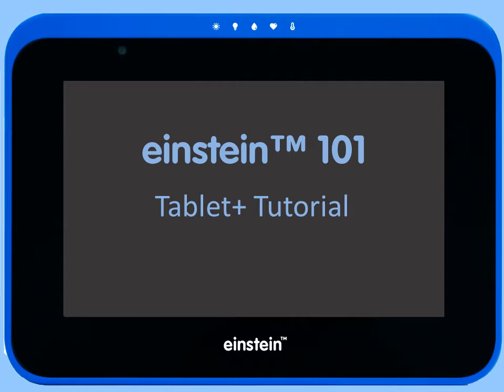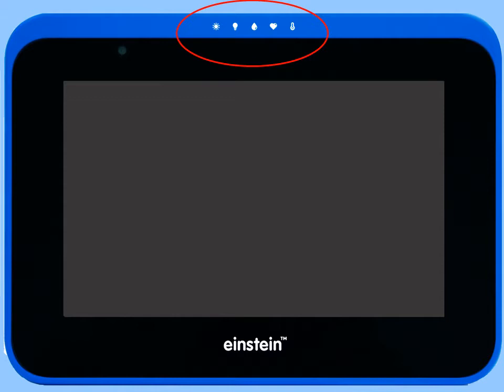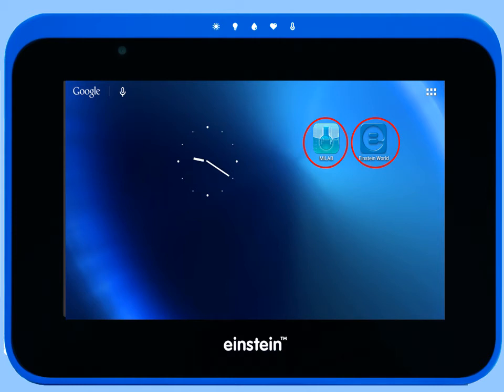The Einstein Tablet runs on the Android operating system and includes access to Google Play Store and thousands of different apps. In addition, the Einstein Tablet Plus features eight built-in sensors commonly used in science experiments and comes bundled with the MiLAB and Einstein World apps.